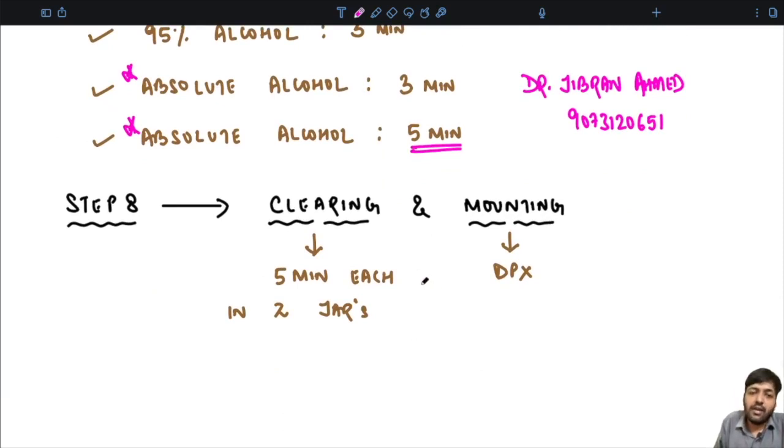For clearing, remember, you carry it out for 5 minutes each in 2 jars of xylene. How it is done, I will tell you. And mounting is done using DPX. What DPX is, how the clearing is done and what agent is used, I will tell you in detail. So don't worry about that.